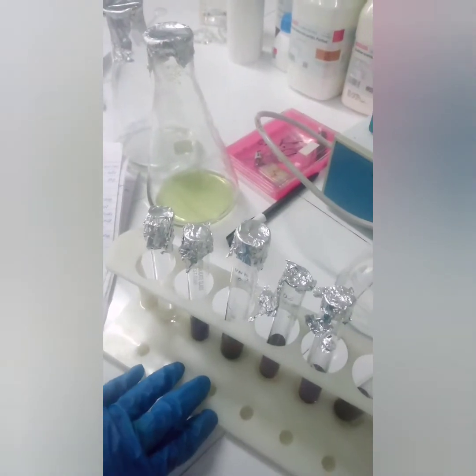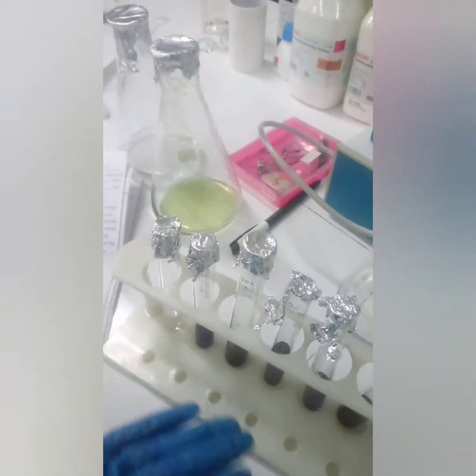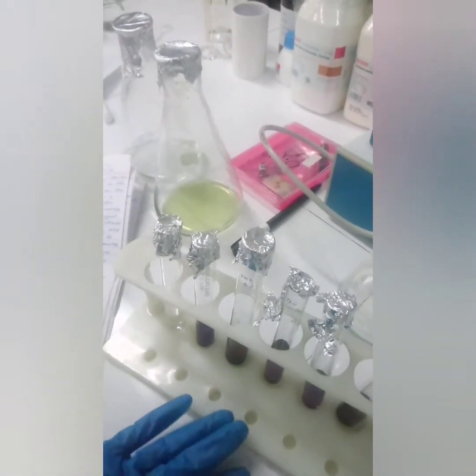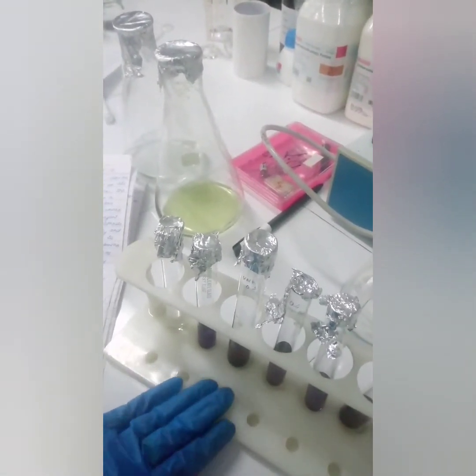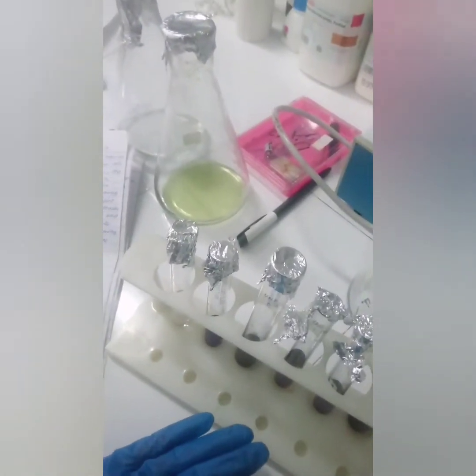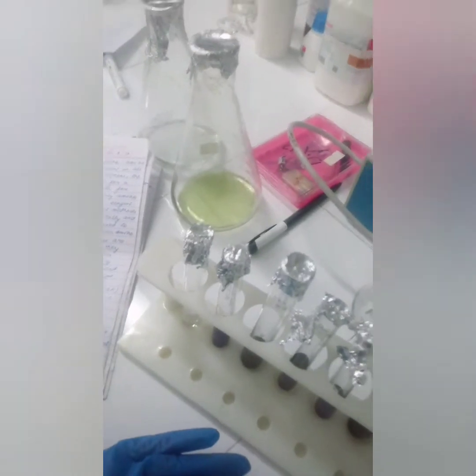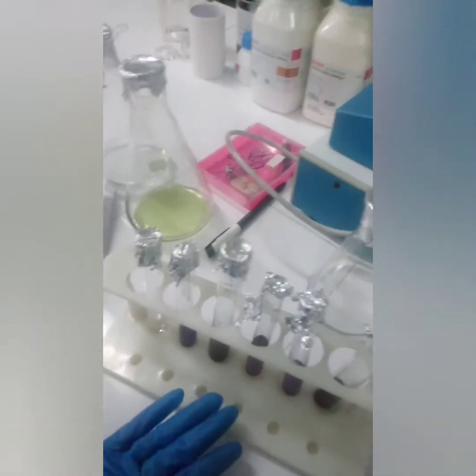The decarboxylation reaction proceeds for free amino acids and does not happen for peptides and proteins. So Ninhydrin reacts only with the free amino group of the amino acid, and this is one of the most important methods for detecting amino acid in a sample.